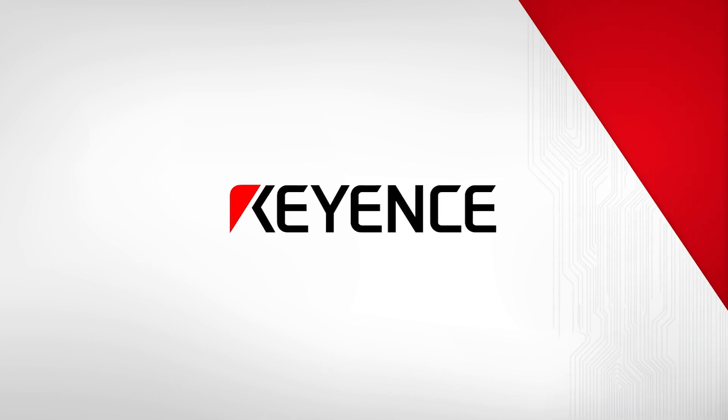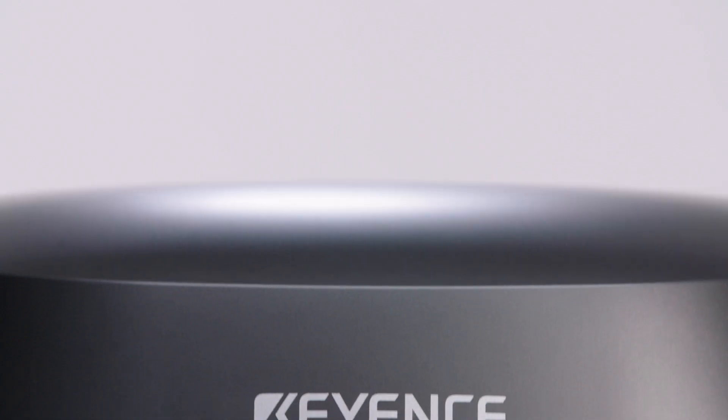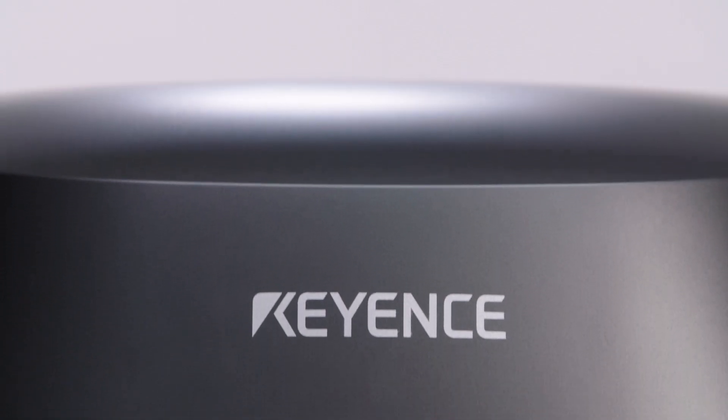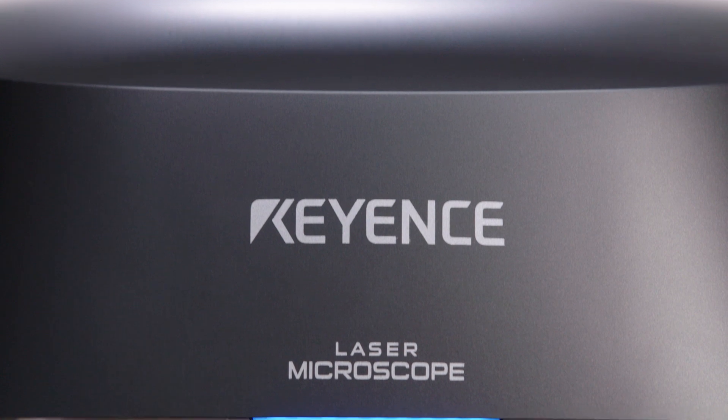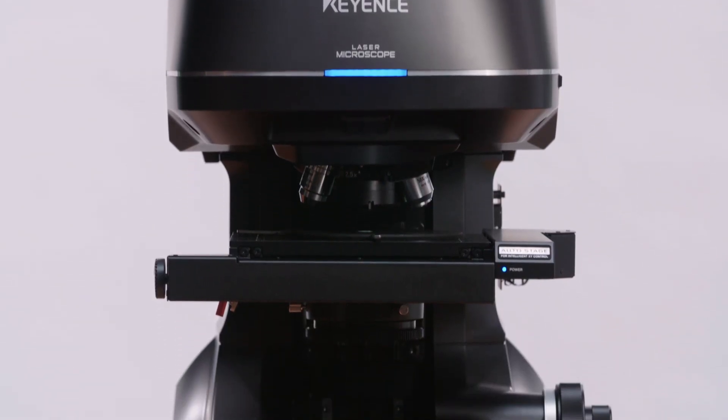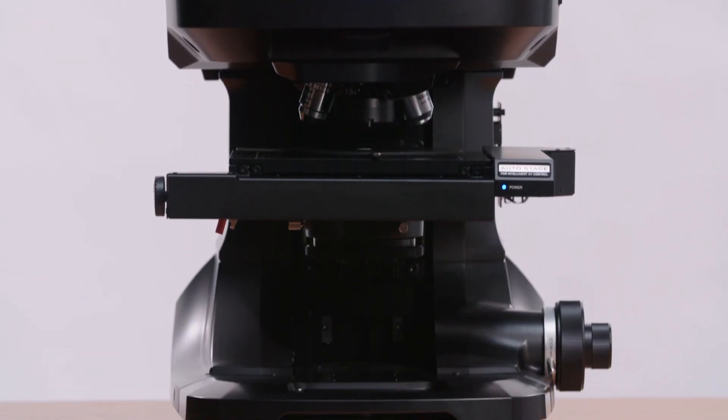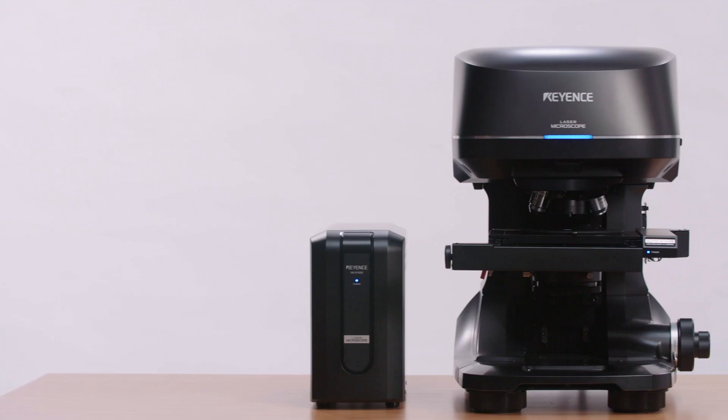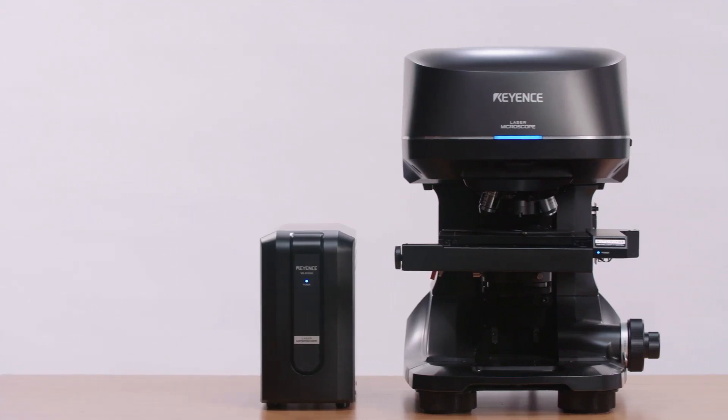Keyence is proud to announce the newest innovation to its 3D microscopy and surface measurement lineup, the VKX1000 3D laser scanning confocal microscope.